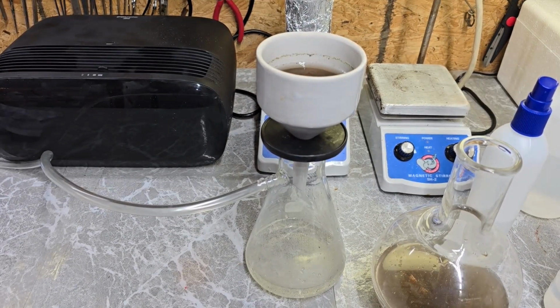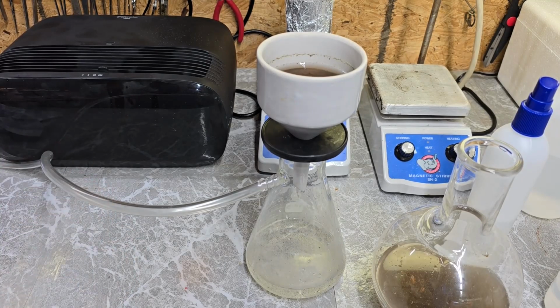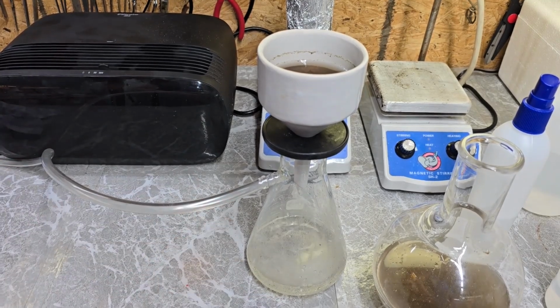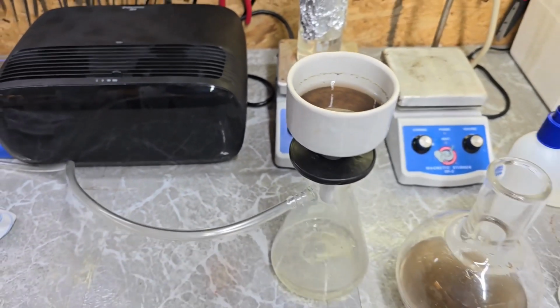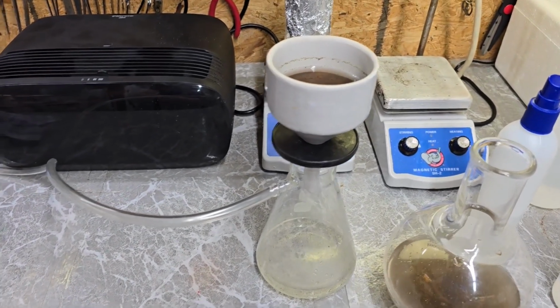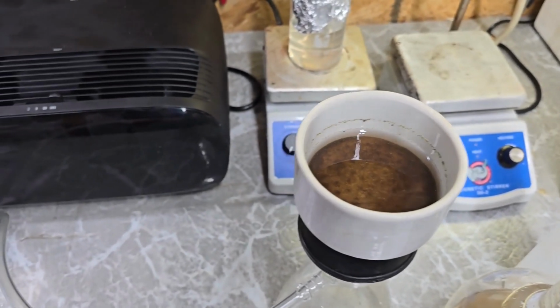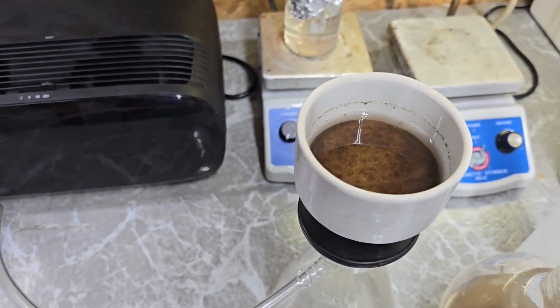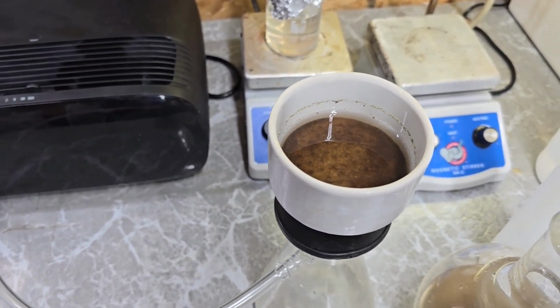Okay, you can hear the vacuum pump over here going off, and it has been over 20 minutes, and it has only gotten to this point right here. I mean, it's over halfway filtered, but I think I'm going to call it, and I'm actually going to siphon the remaining water that is in there out of the Buchner funnel.